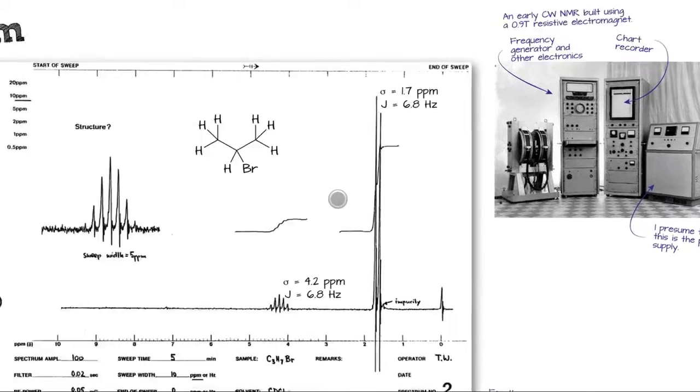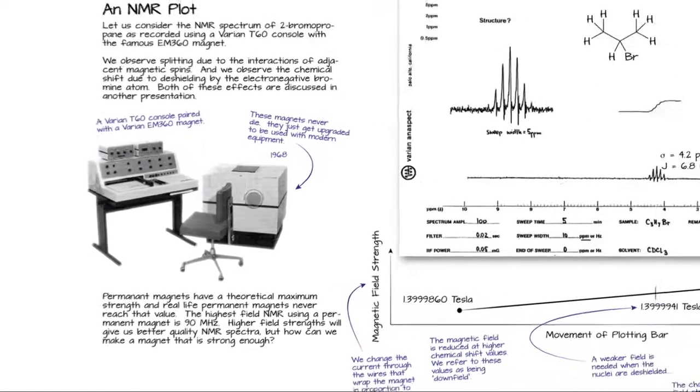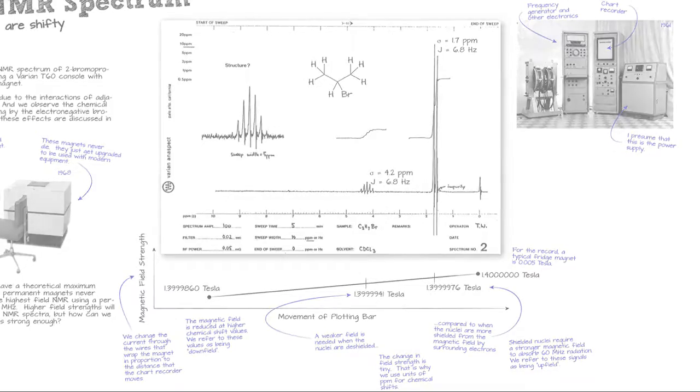Of course, the T-60 quickly became the number one seller for Varian, and they were selling continuous wave instruments like crazy. They were having a great time selling continuous wave instruments and not really thinking about the future. Why would you when you're selling continuous wave instruments like crazy? You don't have to innovate, or do you?